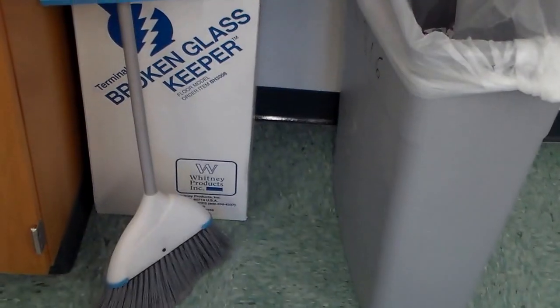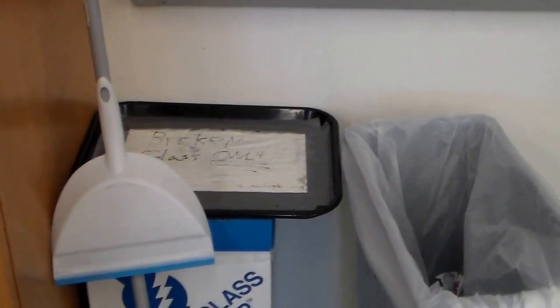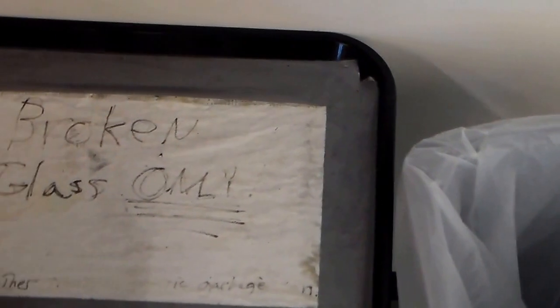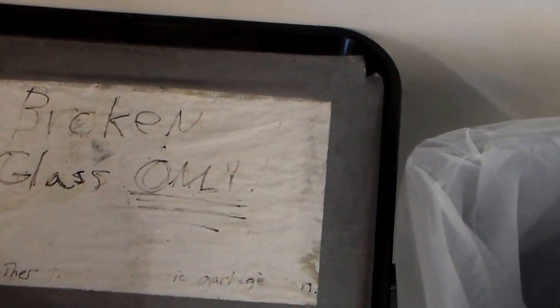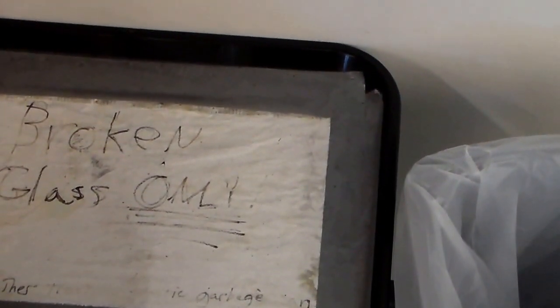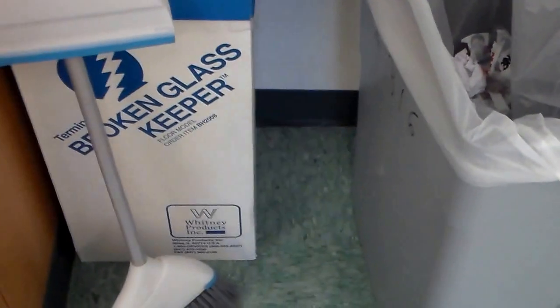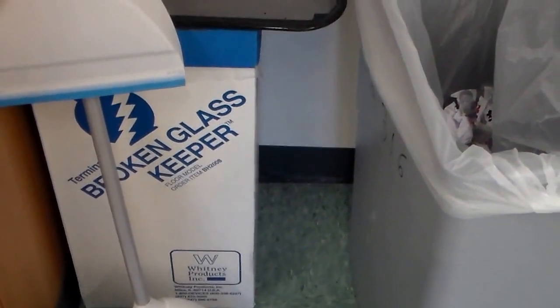You can see that we have a broom here and a dustpan. Generally the faculty will handle cleaning up broken glassware. To remind us that only broken glass goes in this box, we have a tray saying broken glass only. That way we aren't paying the expensive disposal rates for broken glass for paper. So please make sure you use the normal garbage can for paper.